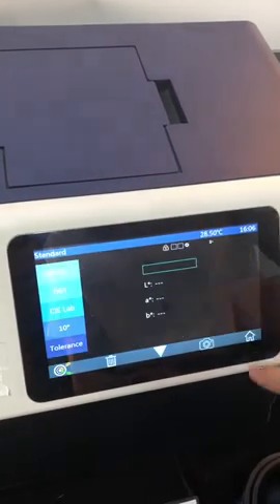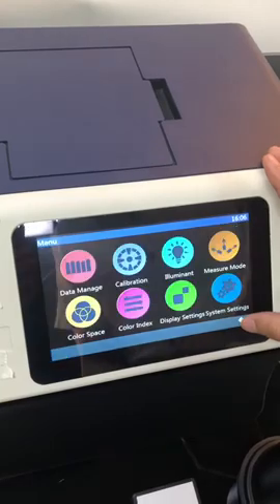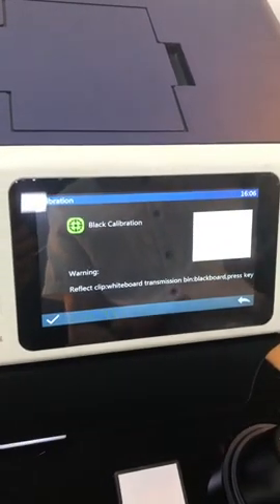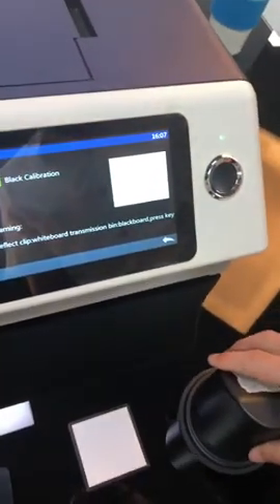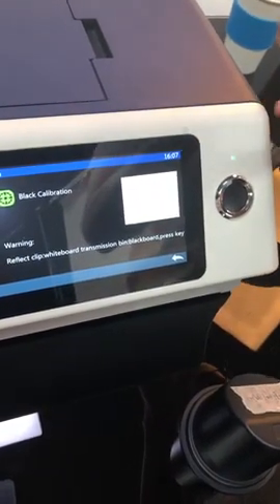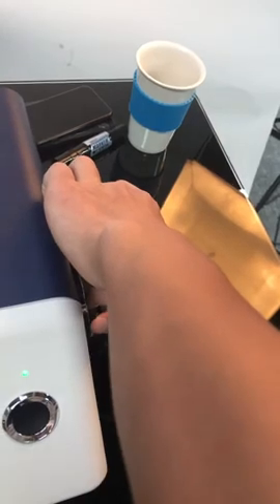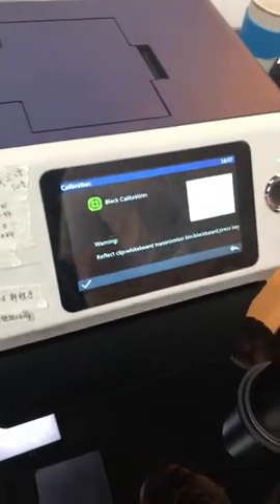Here is the most important step: calibration. First is black calibration. Black calibration requires a few steps. First, we put the white calibration board at the reflective measurement port here. The white calibration board needs to be here.